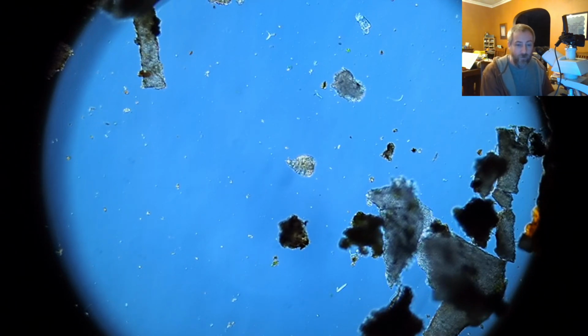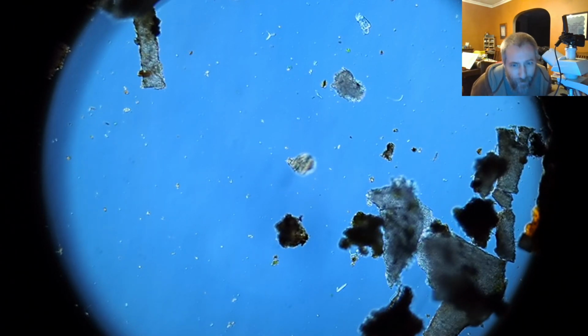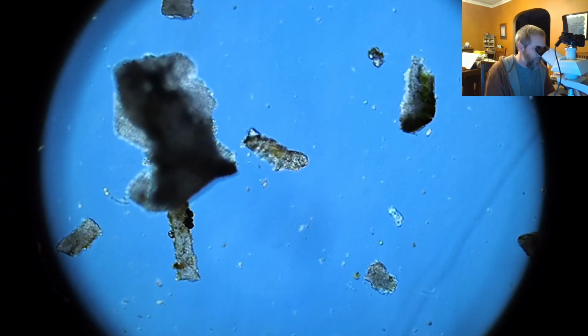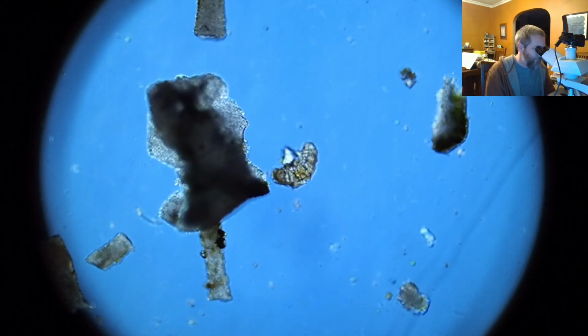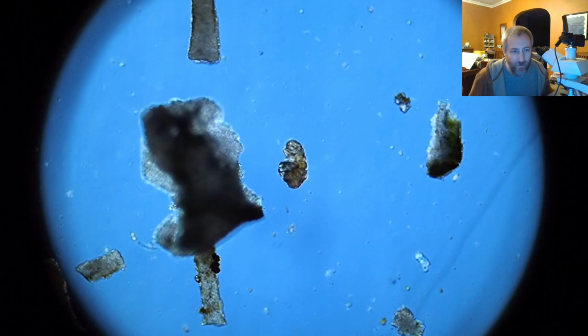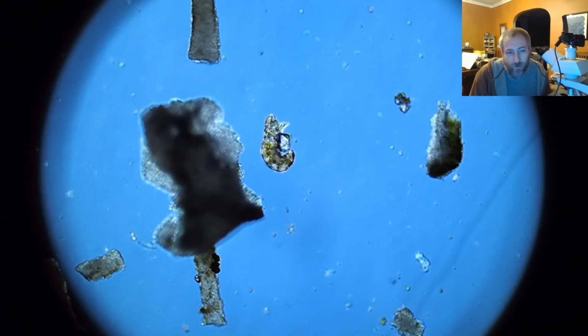I wanted to try to find one that was still sort of coming out of its cryptobiotic state for you, to catch it in the act of coming out of that state. But that's a very fat bear. Oh, that's actually just a rotifer that you're looking at, but the bear is up here. Here it is. There it is. I tried to get them as they were coming out of their cryptobiotic state. This one's sort of clinging on to something. There were two of them right next to each other, and they seem well fed.